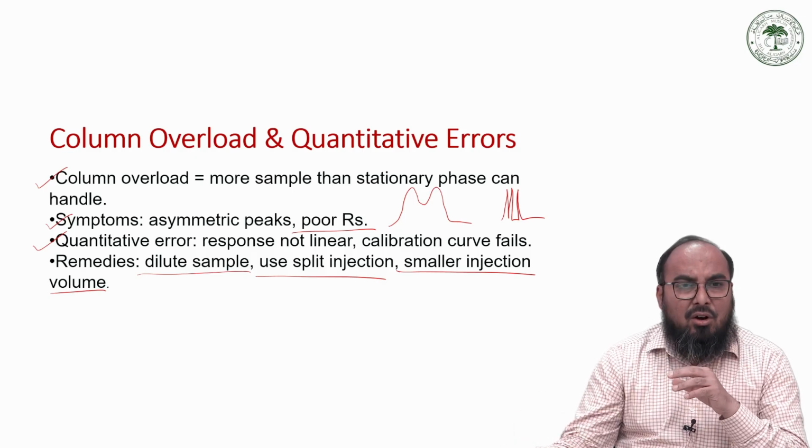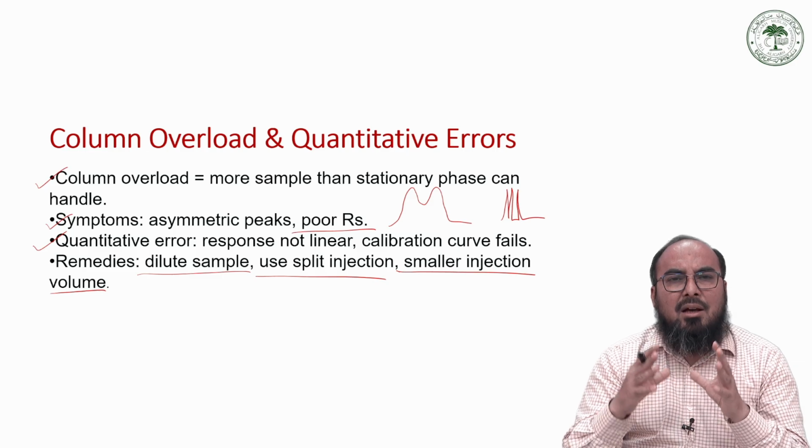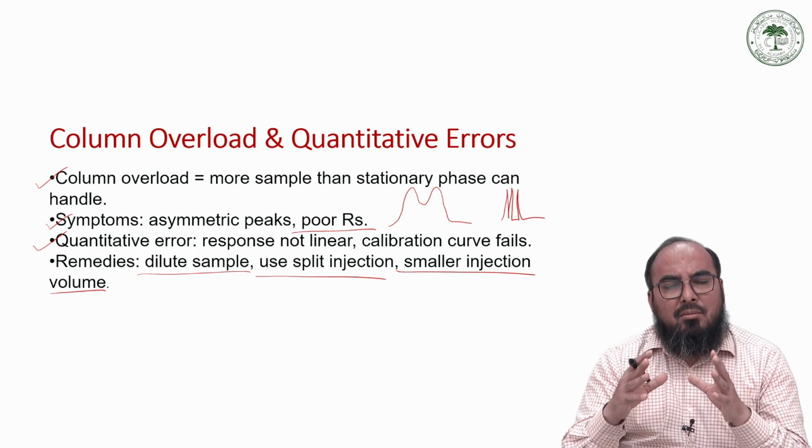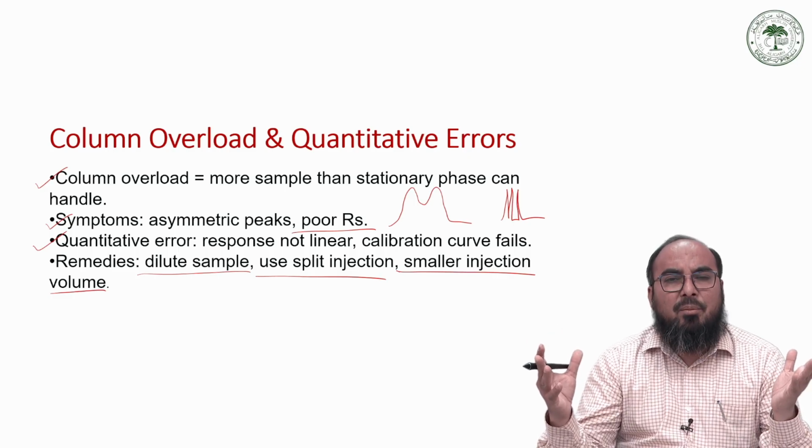Okay, so you have to keep all these things in mind so that you can effectively work with your GC and you can get the best resolved peaks, so that you can have a very effective separation of your vaporized sample.